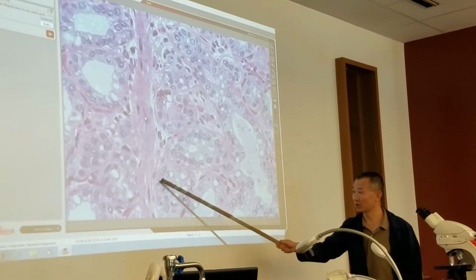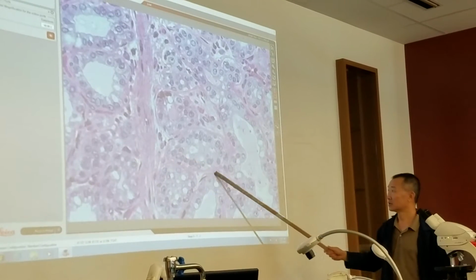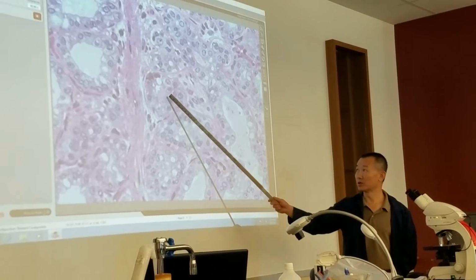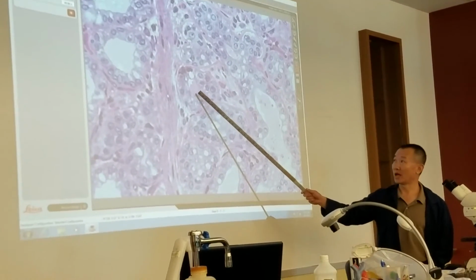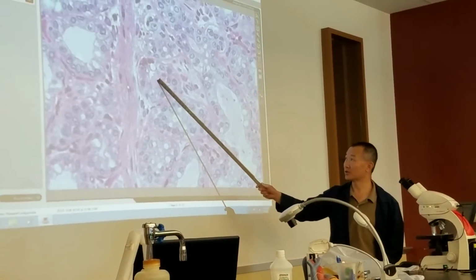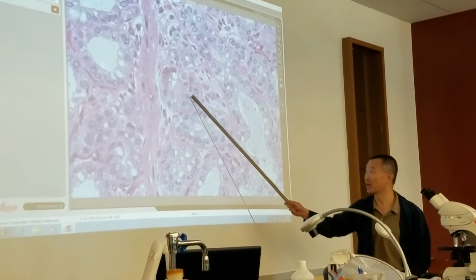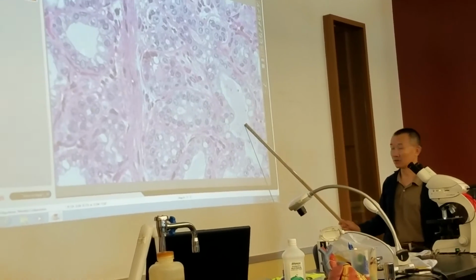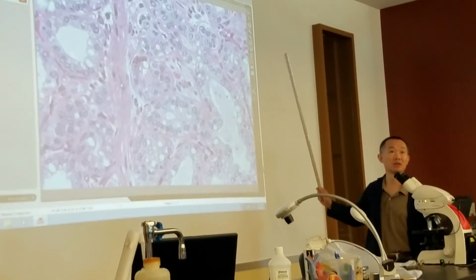Glandular alveoli are within the lobule. Look at this. This is one. This is one. This is one. This glandular alveolus also has a lumen. See that? When half of the cells are pinched off, this is actually a tube connecting to this. Gradually descending to this, and this connecting to the larger one.